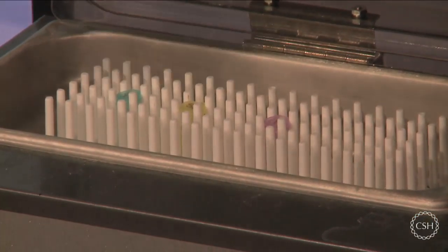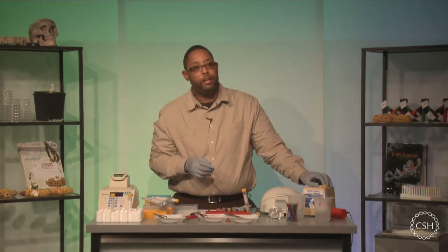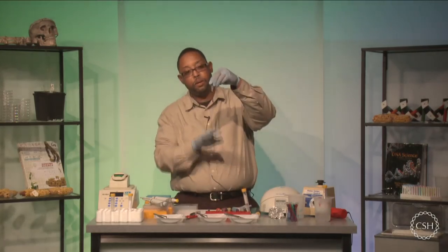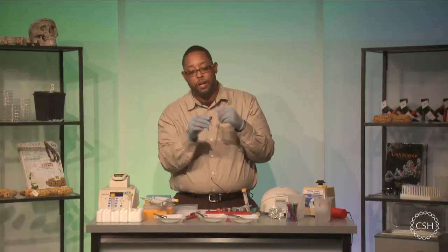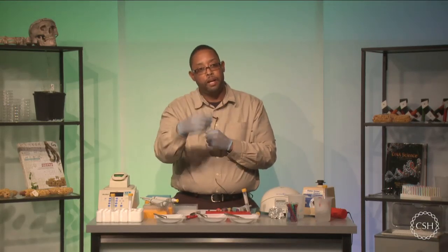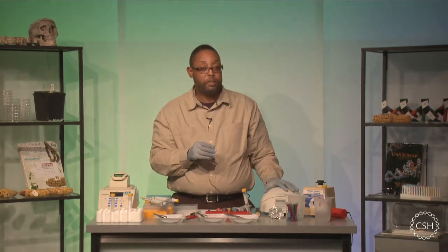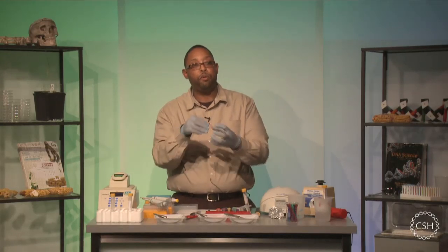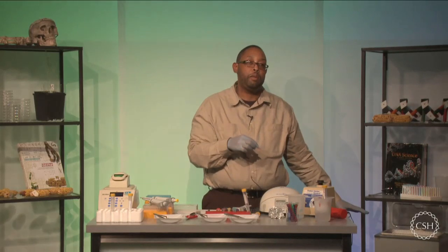Now, if you wish to, you can put your samples into a vortexer to mix them a little bit more thoroughly, or you can finger vortex just by hand, or taking your test tube like so and banging the bottom of it just to make sure that everything is thoroughly mixed. Or even if you see things are at the top of the test tube, you can take your test tube and flick it downward to make sure that everything's at the bottom. You do not want to put your samples into the centrifuge, obviously, because you don't want to spin everything down, but just a gentle flick downward will bring any excess material back into the main solution area, and then you can incubate.